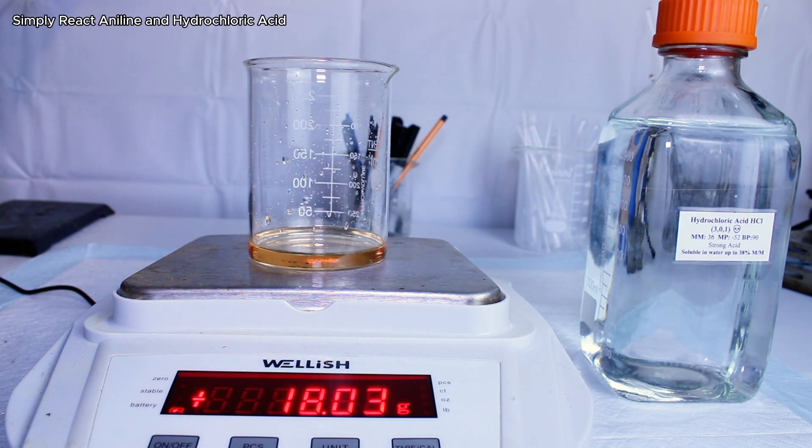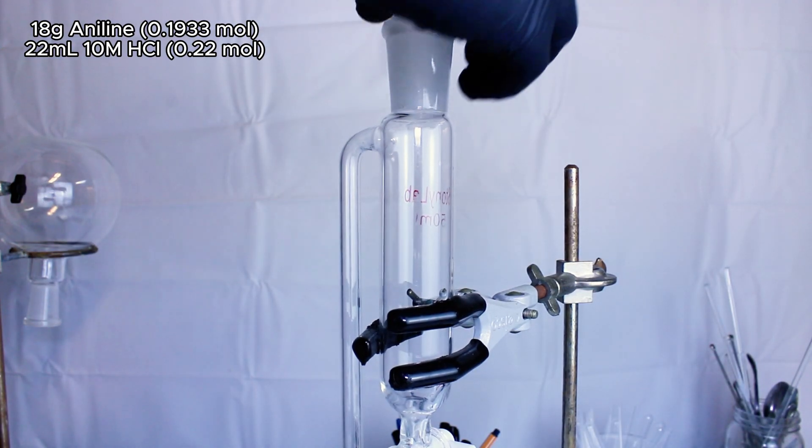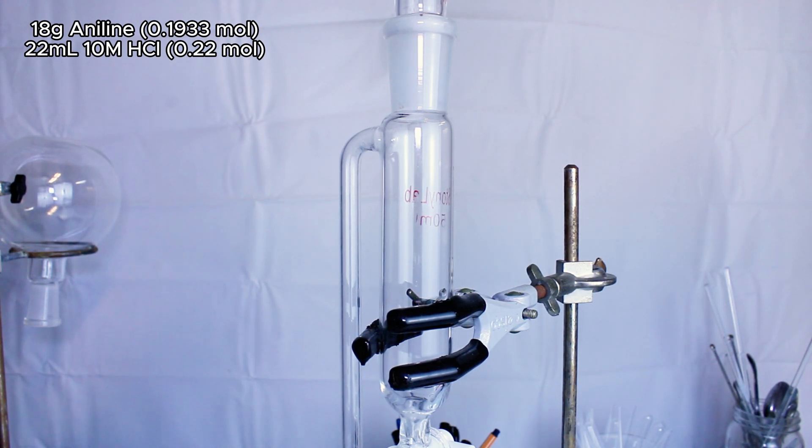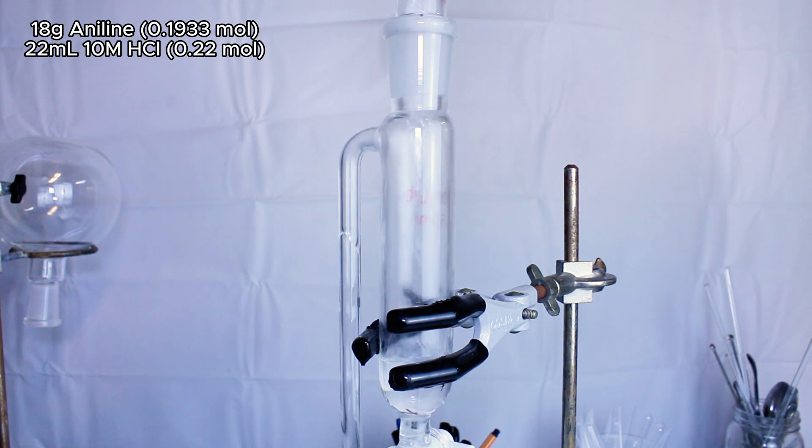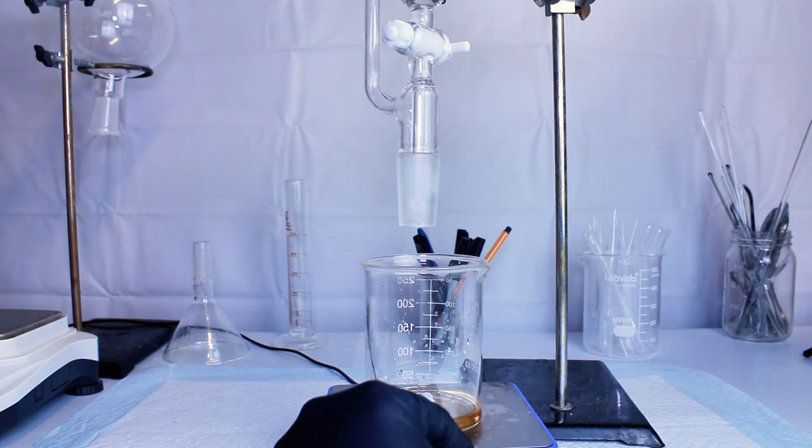To get started, I went ahead and added 18 grams of aniline to a beaker, which represents 0.1933 moles. I then added 22 milliliters of 10 molar hydrochloric acid to an addition funnel, and began to add it to the aniline very slowly and under constant stirring.